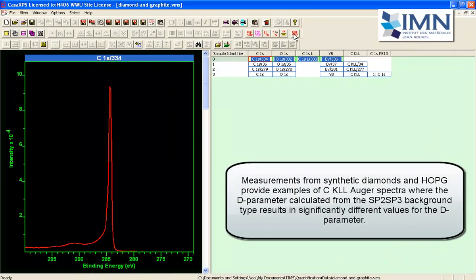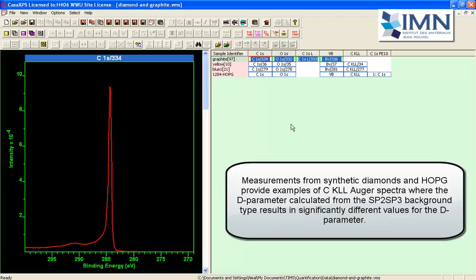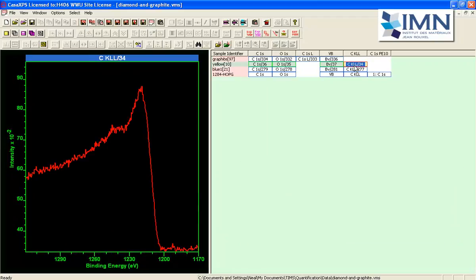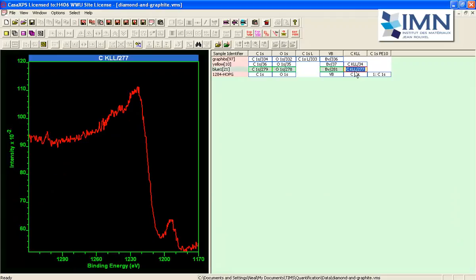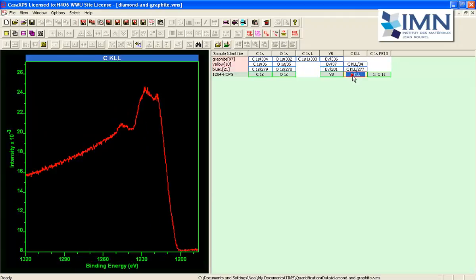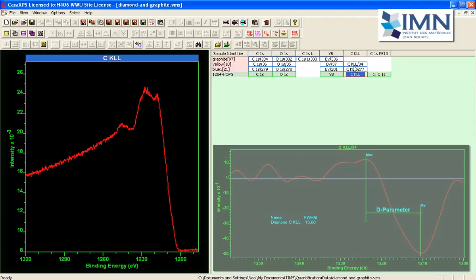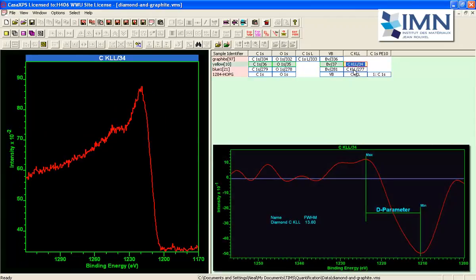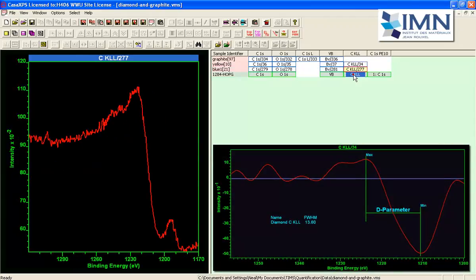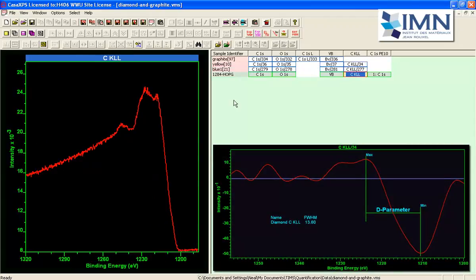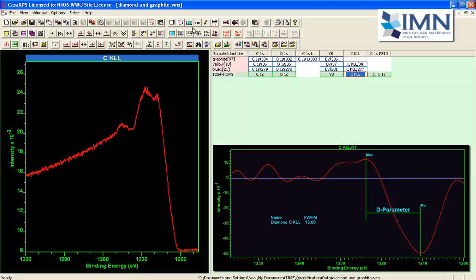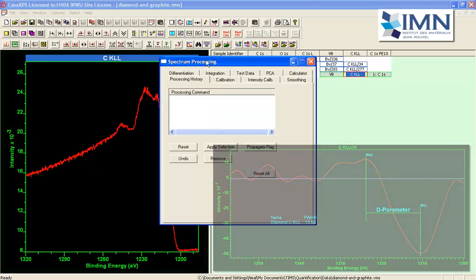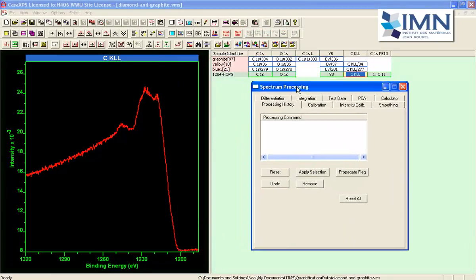These data are from graphite or diamond samples and what we would like to do is see if we can work out a d parameter for these Auger spectra. That is to say we want to differentiate these data and then work out the separation of the maximum to the minimum for these peaks.